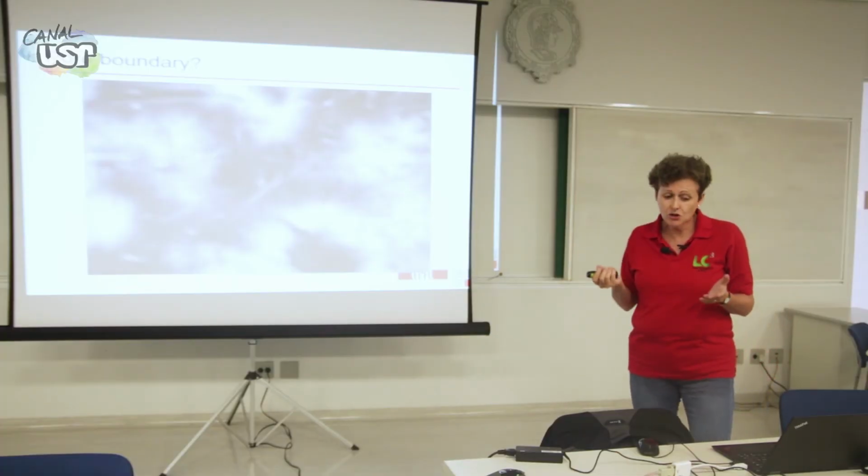And as we're going to talk about this afternoon, the reality is in a well-cured paste, most of the porosity that remains is 10 nanometers in size. And we're nowhere near resolving 10 nanometers in these pictures. This shows the fracture surface, the same problem.